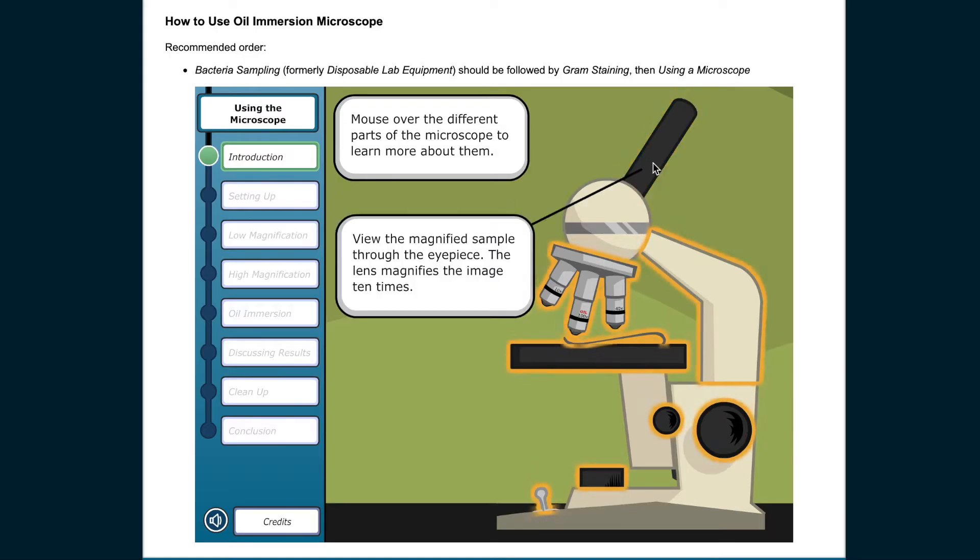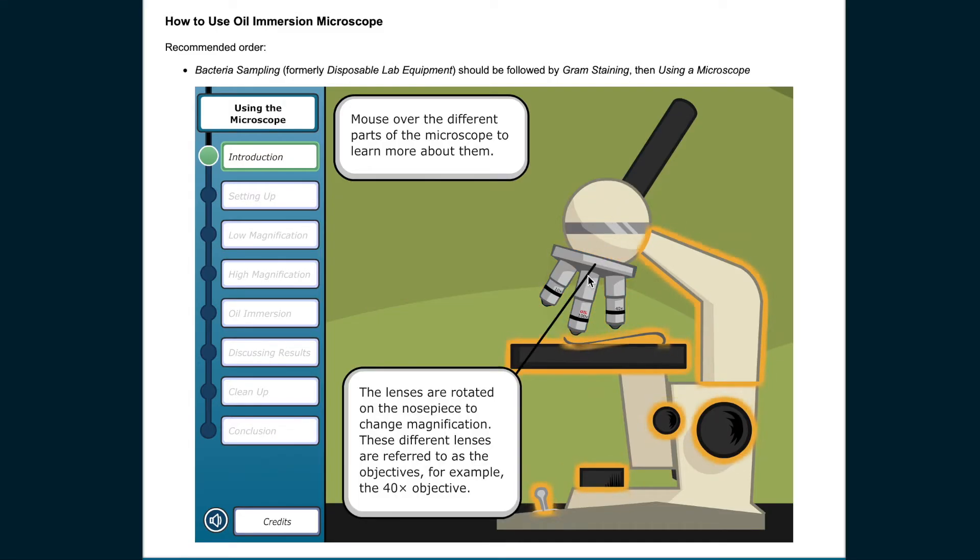Mouse over the different parts of the microscope to learn more about them. View the magnified sample through the eyepiece. The lens magnifies the image 10x. The lenses are rotated on the nose piece to change magnification. These different lenses are referred to as the objectives. For example, the 40x objective.